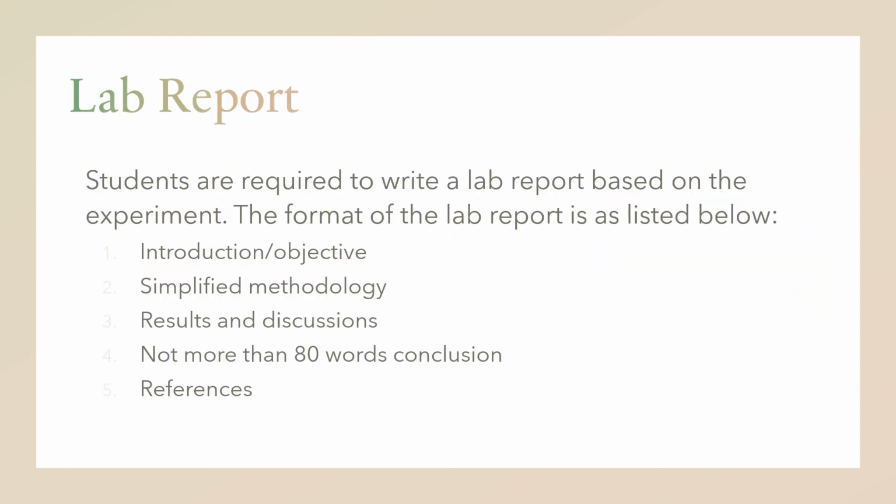So in this lab report, students are required to write a simplified lab report based on the experiment. These are among the elements that are required. Just a simple introduction to the experiment and the objective of the experiment, and then a simplified methodology as what I explained. So you just put in what I explained, and you can Google search a bit in order to add more to it.